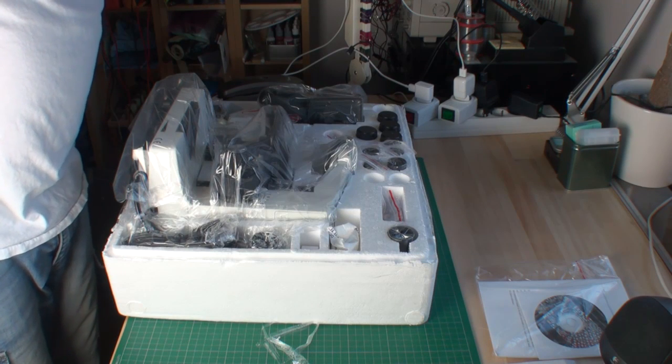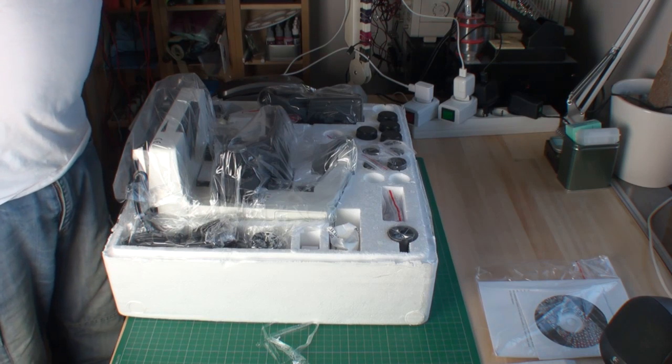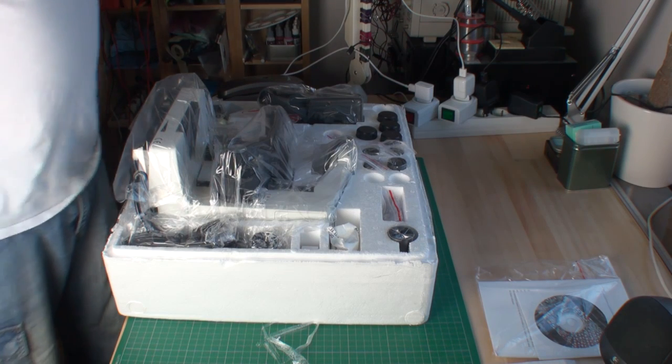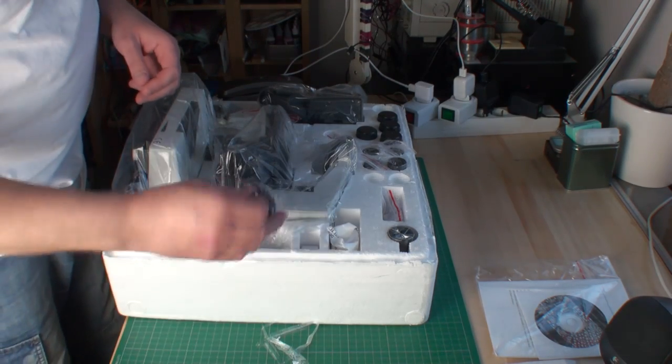Today I received something that I wanted for some time — a new microscope. I just opened the box and I'm going to see what's inside.